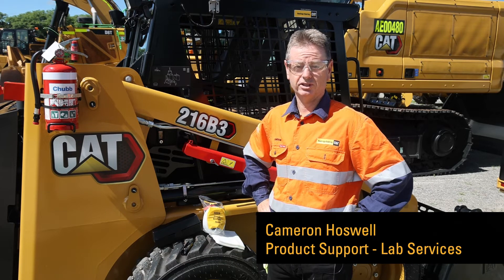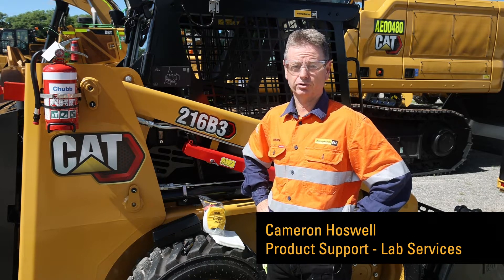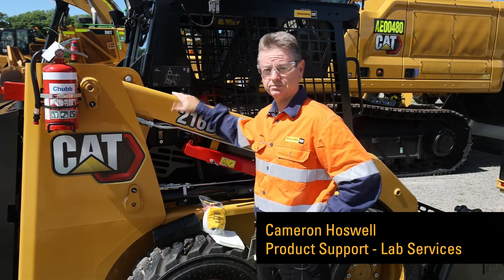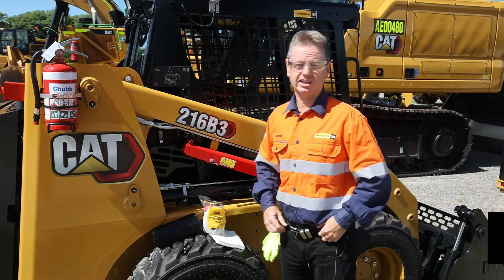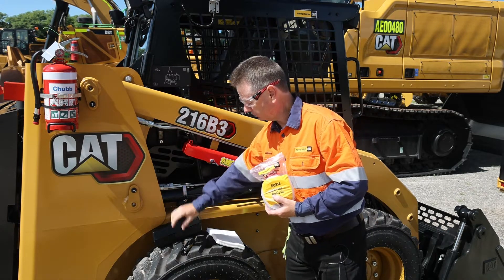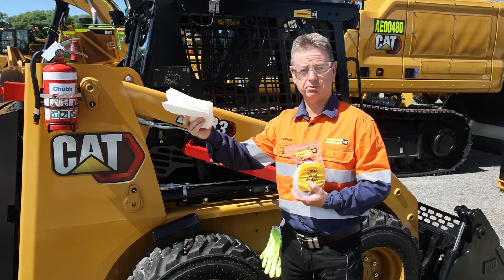Hi, I'm Cameron Hoswell from the Hastings Deering SOS laboratory. Today I'm going to show you how to take an SOS 18 fuel sample from this small skid steer loader. When you take an SOS 18 sample, what you will require is the SOS 18 kit, a sample pump, a tubing cutter, and some clean paper towel.